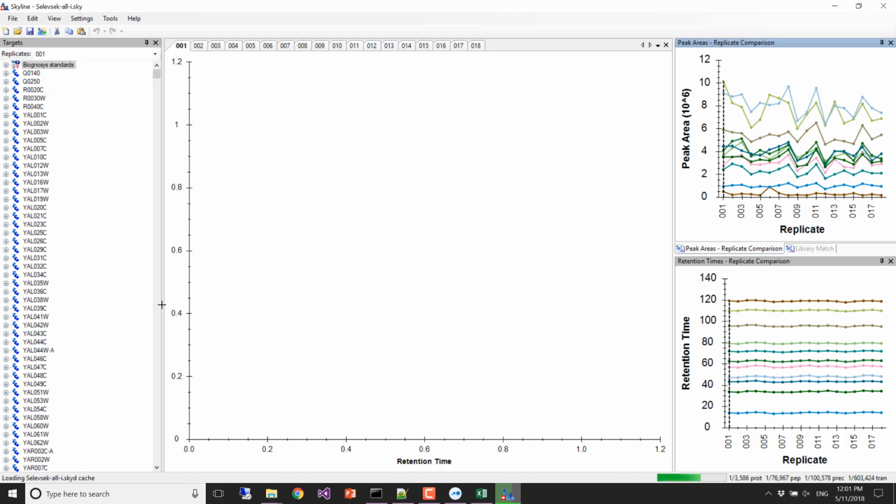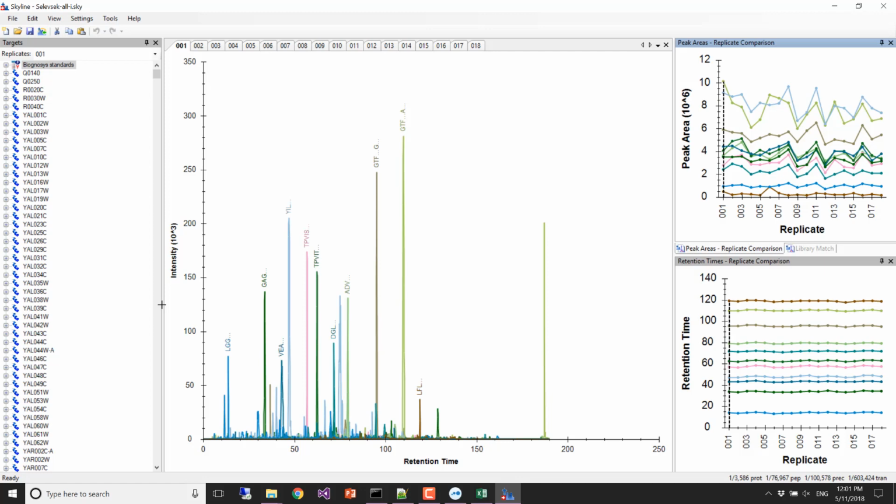Yes, I think it's hard to say, but it's my belief that you can sort of do the hypothetical experiment in your head. You're adding noise to your measurements. If you can have low noise measurements of the same proteins, it is not helpful to increase the noise.